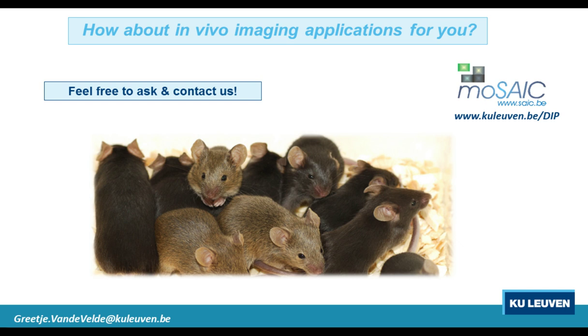So what you have to keep in mind is indeed that image acquisition is one thing, but you probably spend a bit more time on the data processing. But even taking all that into account, if you compare it with a standard workup like histology, sacrificing animals, staining, doing microscopy, it's so much easier and faster compared to that. So let data processing not scare you away. That's what I would like you to remember.